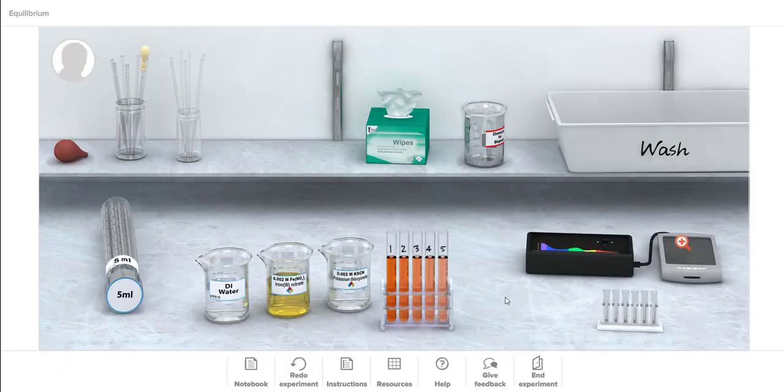Alright, so now we're going to go about the actual spectrophotometer part. So just as before, you're going to use the pure iron nitrate yellow solution as your blank, and then you're going to measure the absorbance of each of the solutions that you prepared. Make sure after you fill your cuvettes, you use the wipes to remove any lint or smudges from the cuvettes before proceeding to putting them in the spectrophotometer. And again, we're going to be using the Pasteur pipettes to fill the cuvettes.